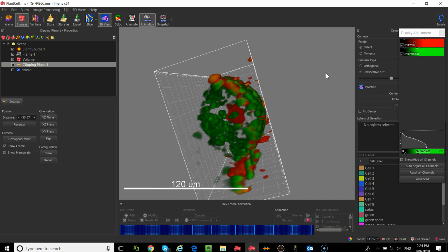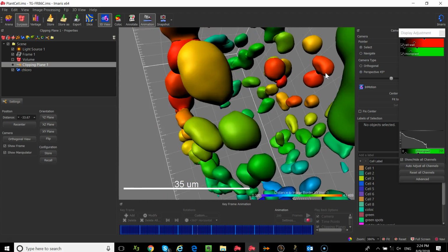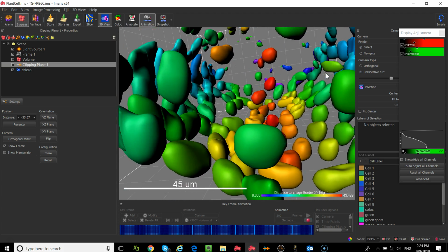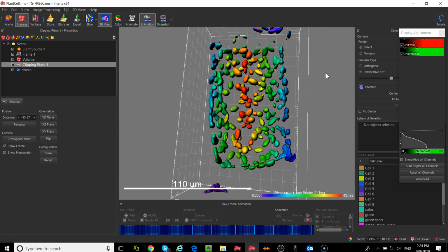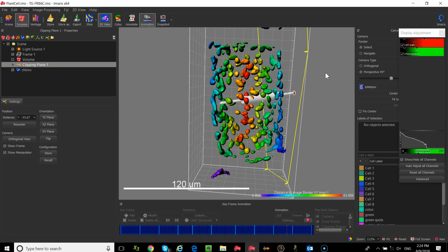Okay, I still have quite a bit to do, so we're going to jump really quickly into some co-localization. I'm going to use this data set to demonstrate one part, and then we're going to switch to a slightly different data set to do another part. So, okay. Oh, my manipulator's in there. No!